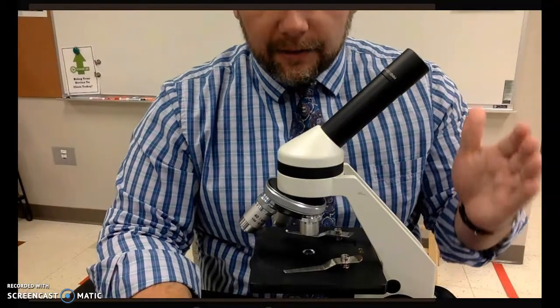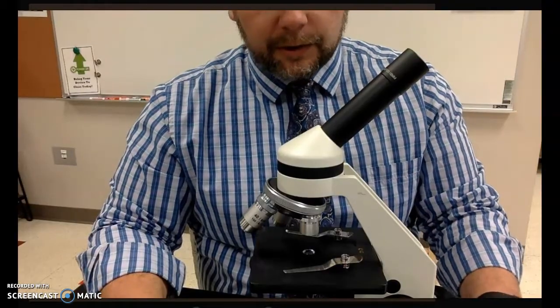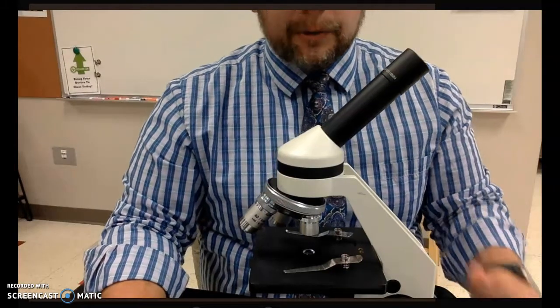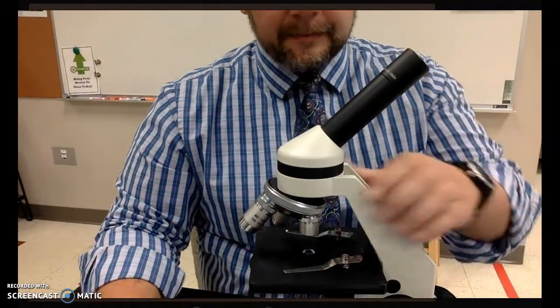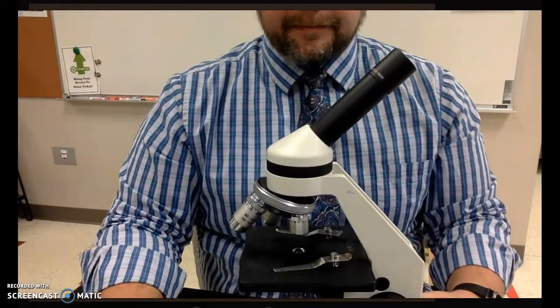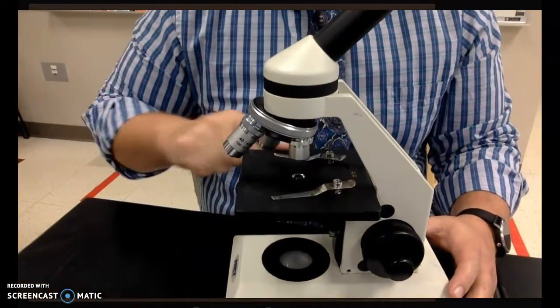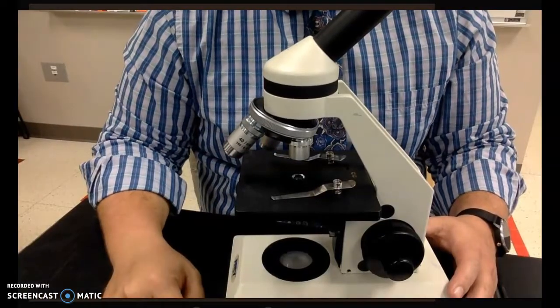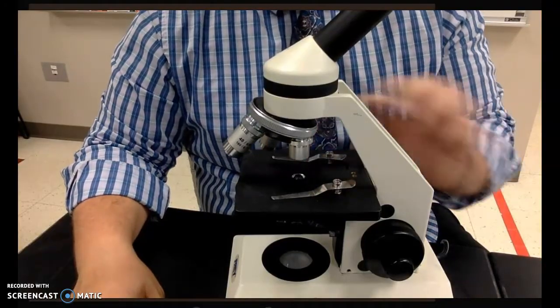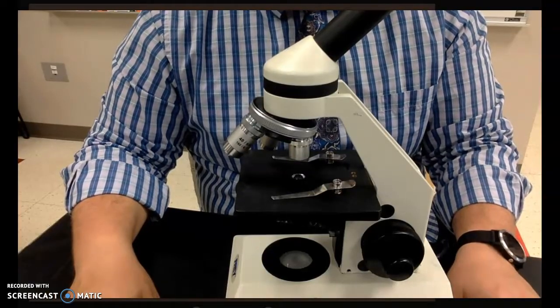Moving on down, on the other side from the objective lenses, we have what is called the arm of the microscope. The arm of the microscope simply holds up the objective lenses so it can hold it above the specimen. Whenever you carry the microscope, you actually do hold it by the arm. Moving down, we have this large black square. This is known as the stage. The stage is where you will place your specimen, which is on a slide, and it allows you to see things or hold things up.